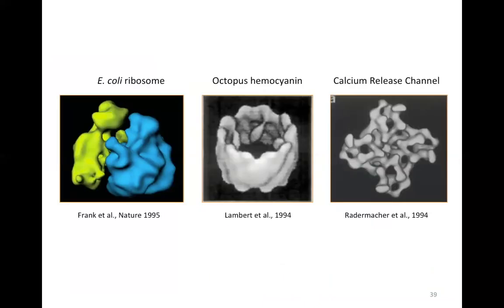I just should mention that after the bootstrap reconstruction, we need an iterative angular refinement, and this principle is shown here. So around that time, in the beginning of the 90s, there was a very, very enthusiastic situation where we applied this new technique of cryo-EM and single particle techniques to a variety of molecules. And for many of these molecules, this was the first time that they could be seen in 3D because crystals could not be formed.